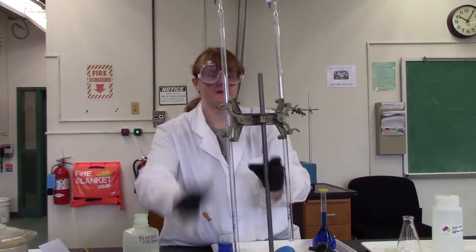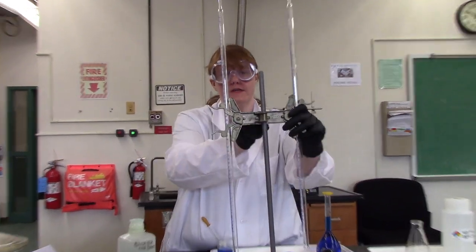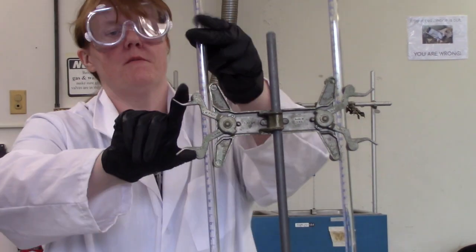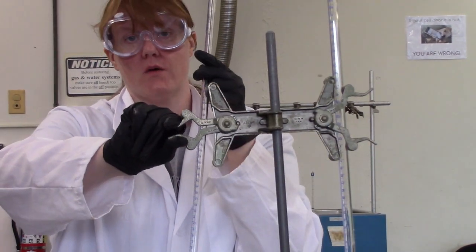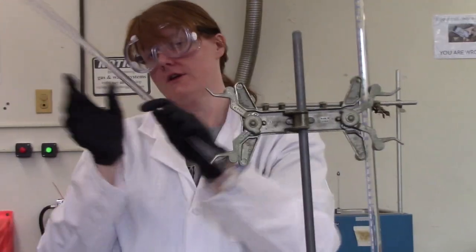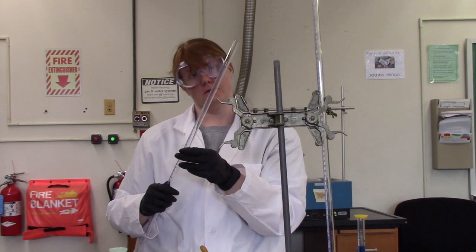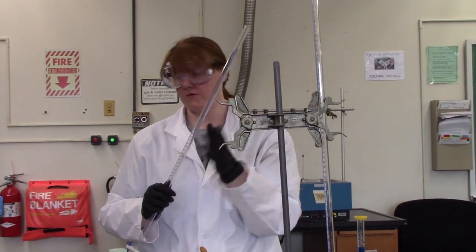Okay. This is called a buret clamp. They're specially designed to hold a buret completely vertical. You operate them by pinching the clamp here to let the buret go. Now, burets aren't super cheap, so make sure you're gentle with this. Don't use it for sword fighting or whacking the table. I know it's tempting. Try to avoid it.